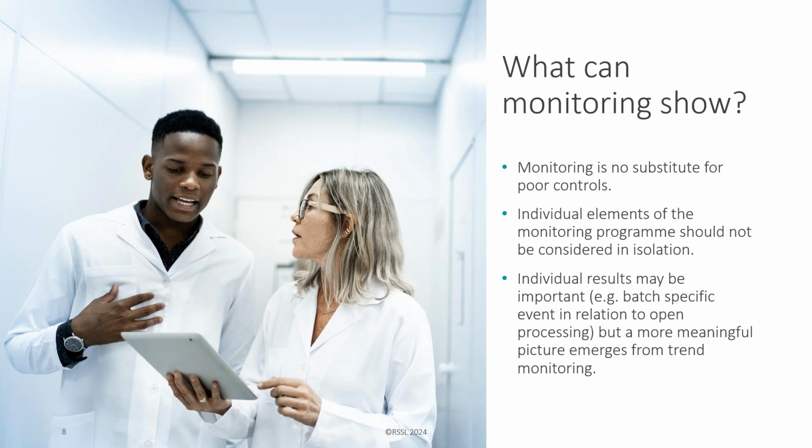But just again to re-emphasize something that I say every time we talk about environmental monitoring, and that's that monitoring is no substitute for control. So we need to get control first, and if we've got weak controls, we mustn't use monitoring to cover up weak practices.